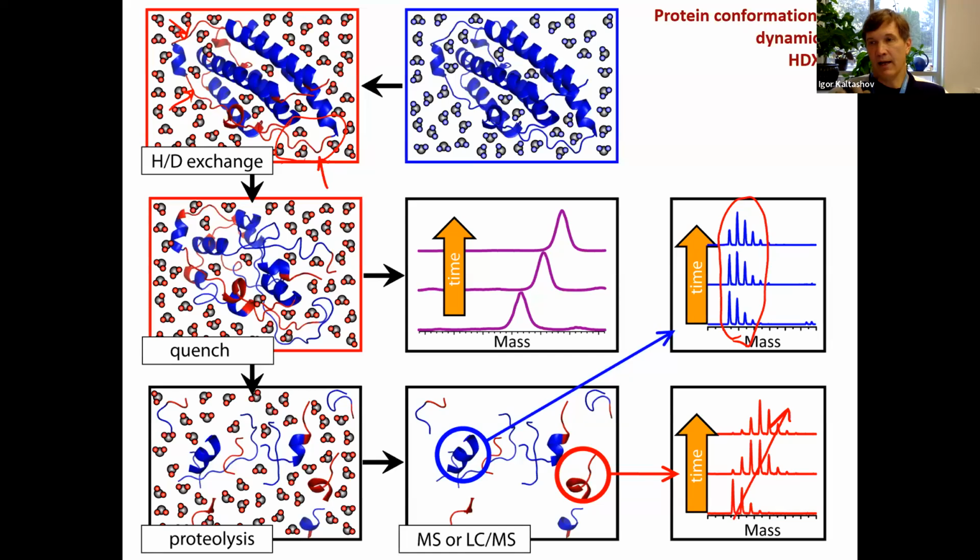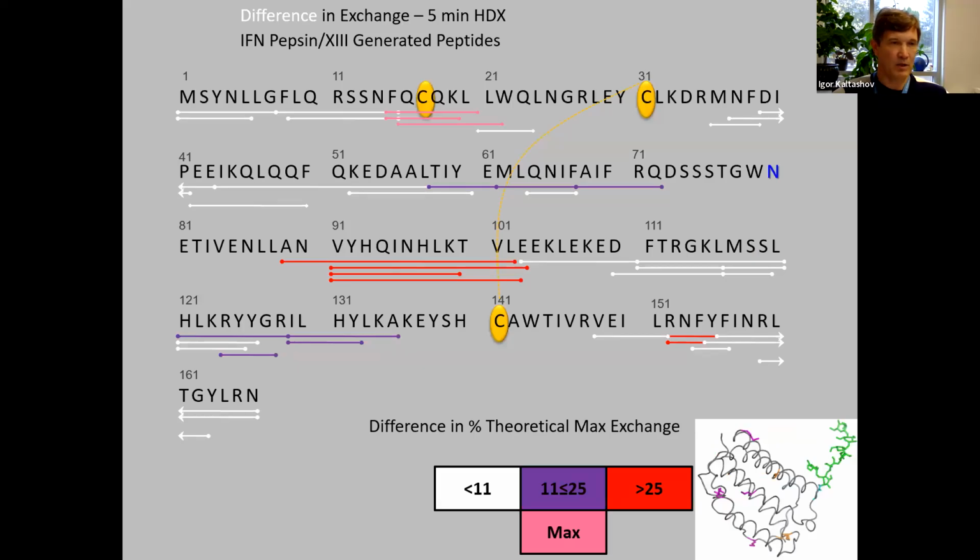And I ran out of time, but I want to make a connection to one of the slides that I had before. So remember, we talked about interferon beta 1A and how it's not a good idea to put NEM functionality on this free cysteine, right? So we've seen just by looking at charge state distributions that the protein begins to feel unhappy, but we couldn't really tell what exactly happened to the protein. So this question can be answered using mass spec, so HD exchange.